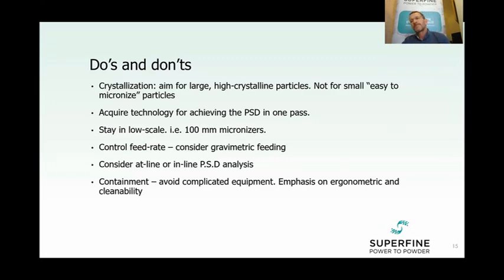And why is that? When you crystallize particles and you design your process to produce small particles, it means that you are on the edge of the crystallization curve, which means that you have a lot of seeding and less growth of the particles, and it means that your particles are less crystalline and less perfect and less uniform. On top of that, since you are centrifuging them, you filter them and you dry them, then to filter and dry small particles is less efficient, and again, you get an inferior product.